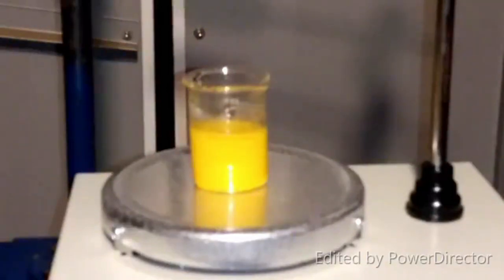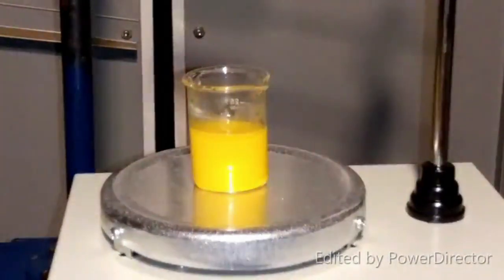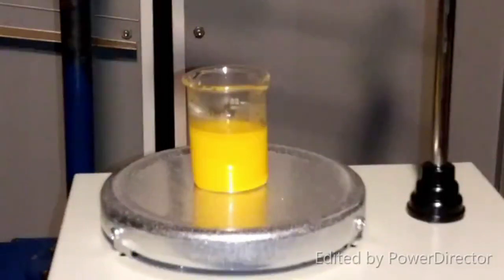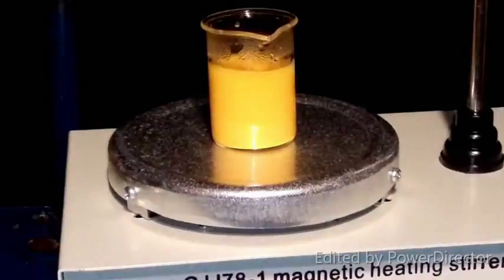Of course, precipitate of dipotassium hexachloroplatinate. But this one might be like the other one last night where it's just going to take a little bit. So I'm going to let this stir on the heat, and hopefully this is going to work. All right, so when I went back and checked the article for this compound, it said it had to be an excess of alkali. I somehow missed that. I added a stoichiometric amount. So let's see if excess KOH will fix this.